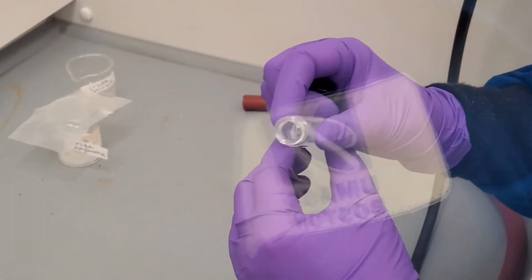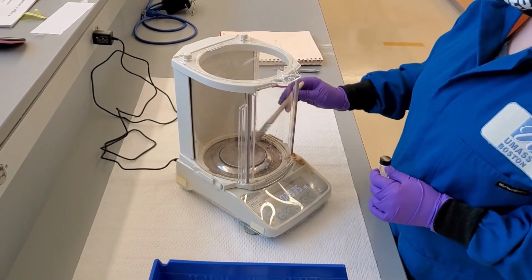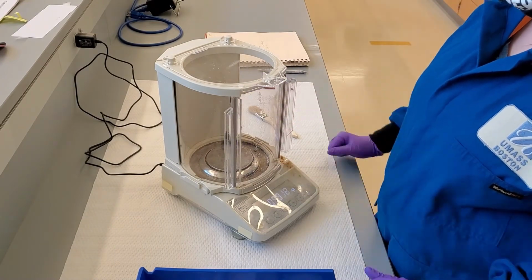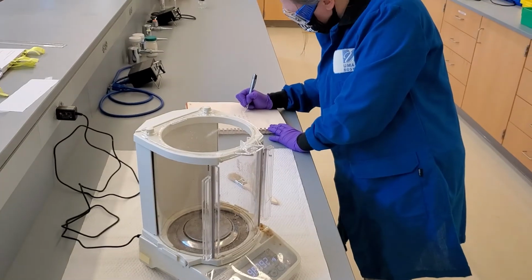Now that the solvent has evaporated, we can weigh the product vial and cap again. Record the weight in your notebook. Subtract the previous weight of the empty product vial and cap from this weight to get the final weight of your product.